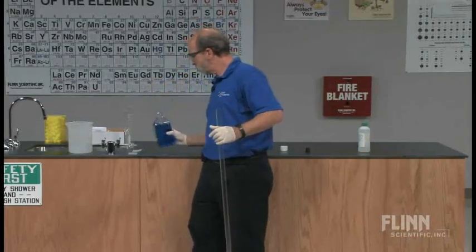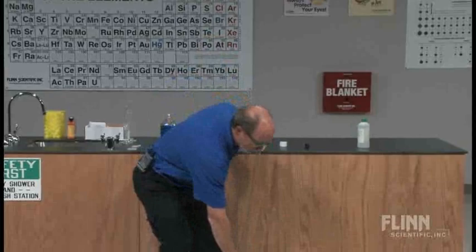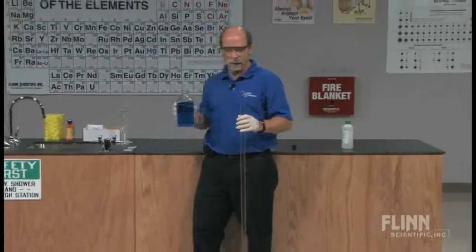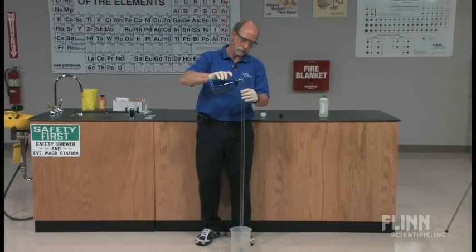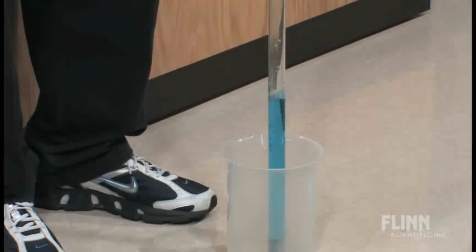Now, to prevent spilling onto the floor, I'm going to take this bucket, and if something happens to spill, at least I'll keep that inside the bucket. I'm going to fill the tube about halfway with the water.